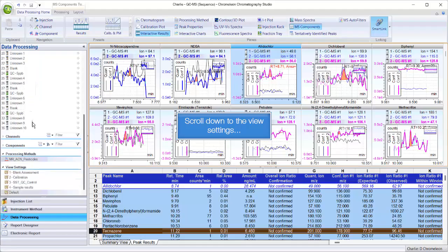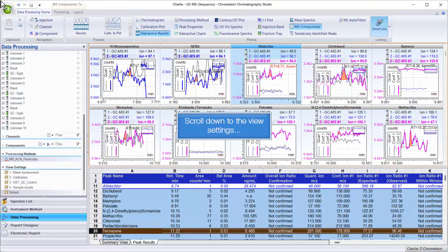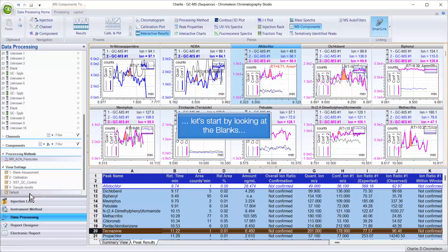Scroll down to the view settings. Let's start by looking at the blanks.